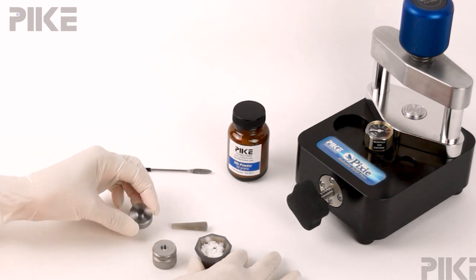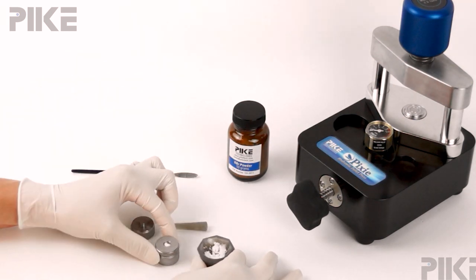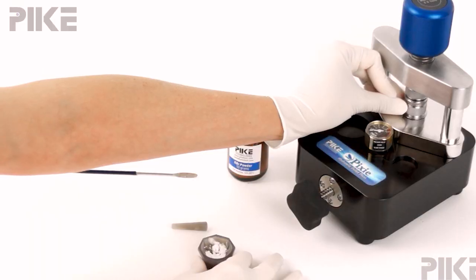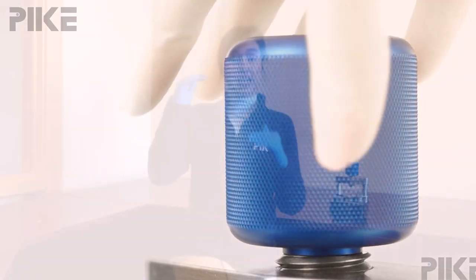Today I've got one more tip for you. When you go ahead and fill your pellet die with your KBr sample mixture, give the die a little tap, tap, tap on the bench top. This will help level out your KBr sample mix, because if your mix is uneven, one side is going to take the brunt of the force. You'll find that part of the pellet is clear, while the low side won't absorb as much force and may be cloudy. So there's your tip this week.